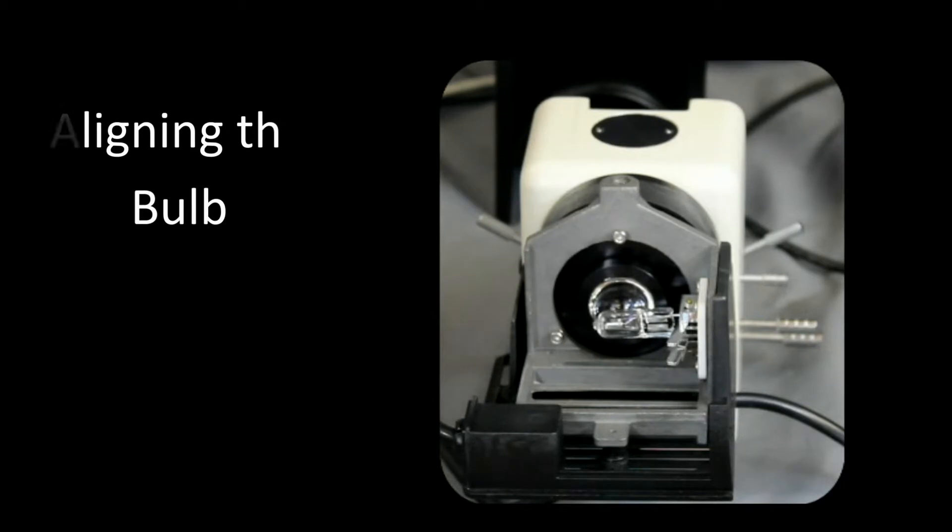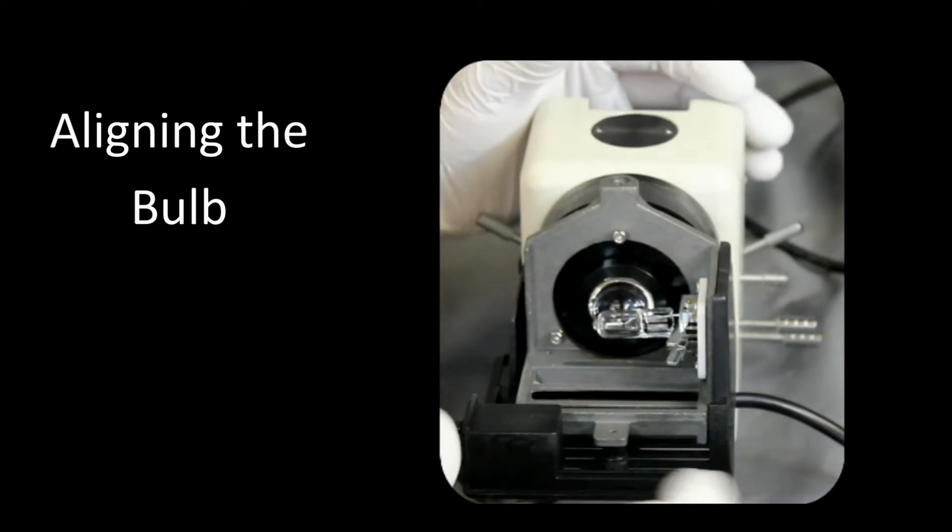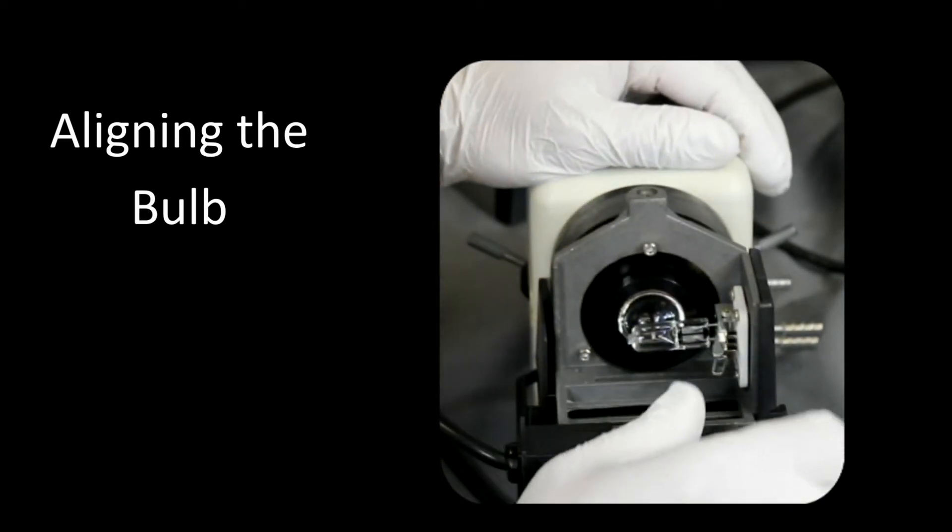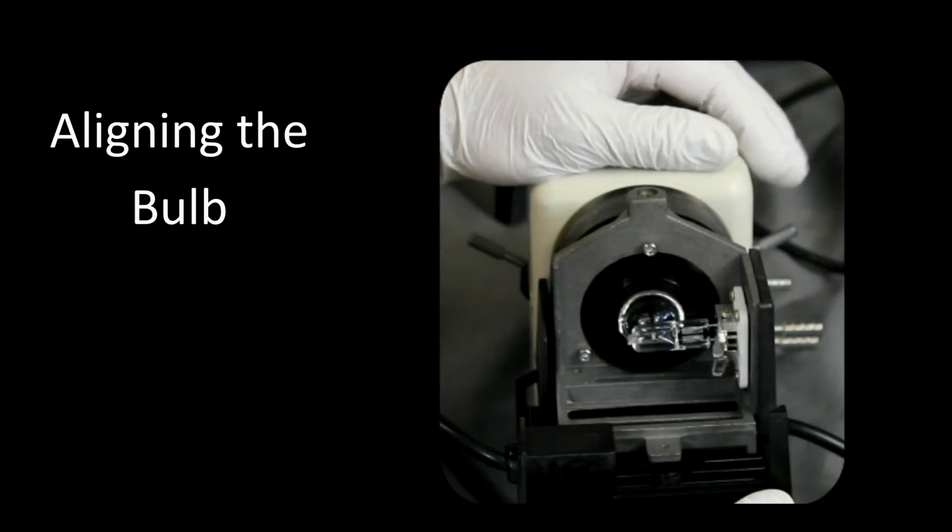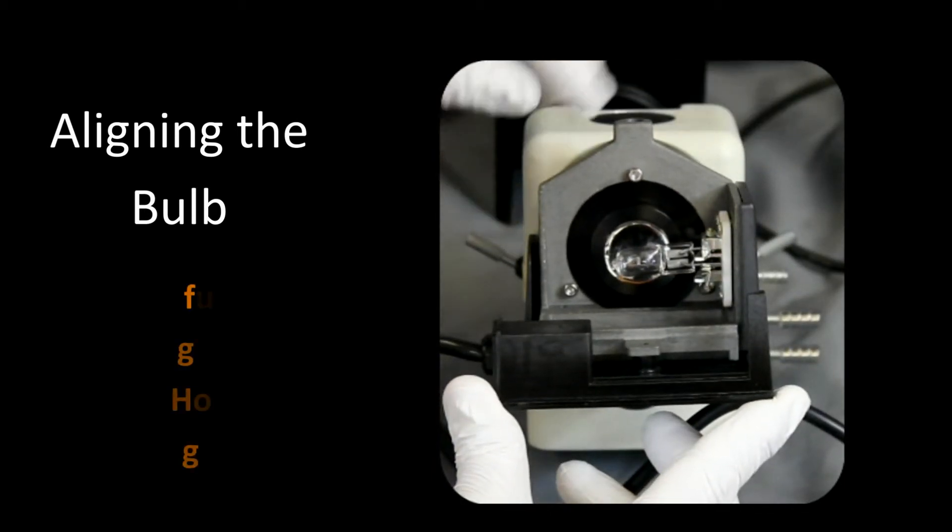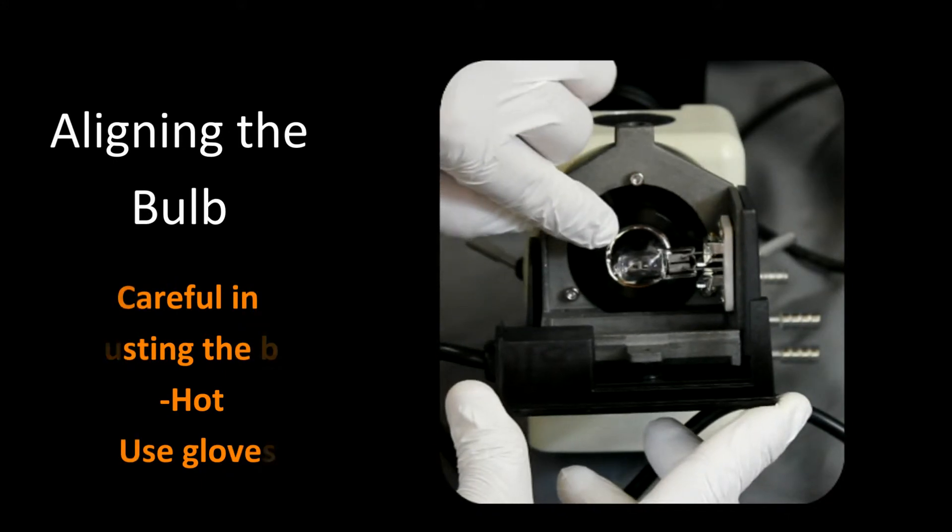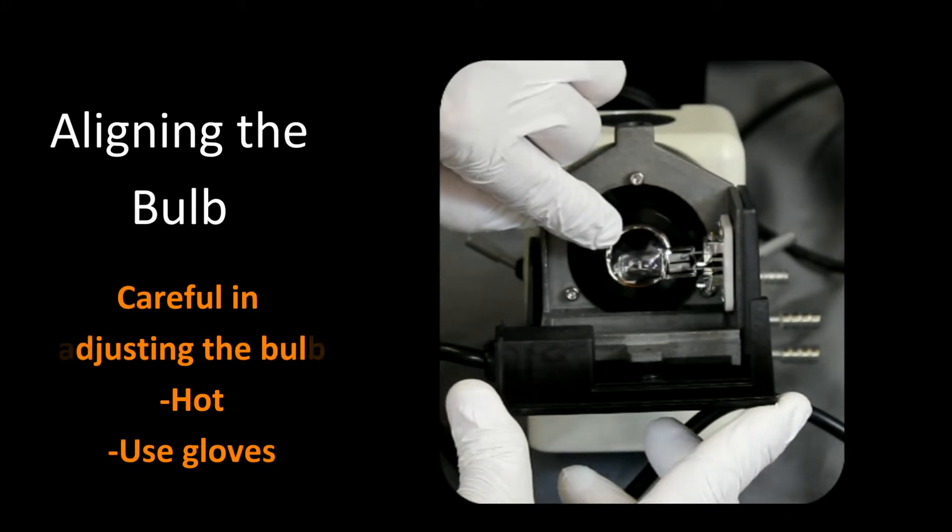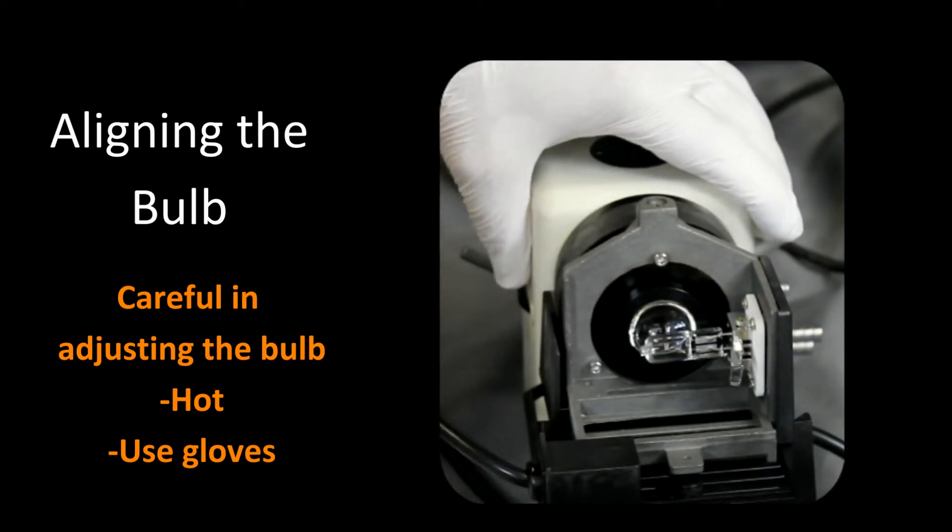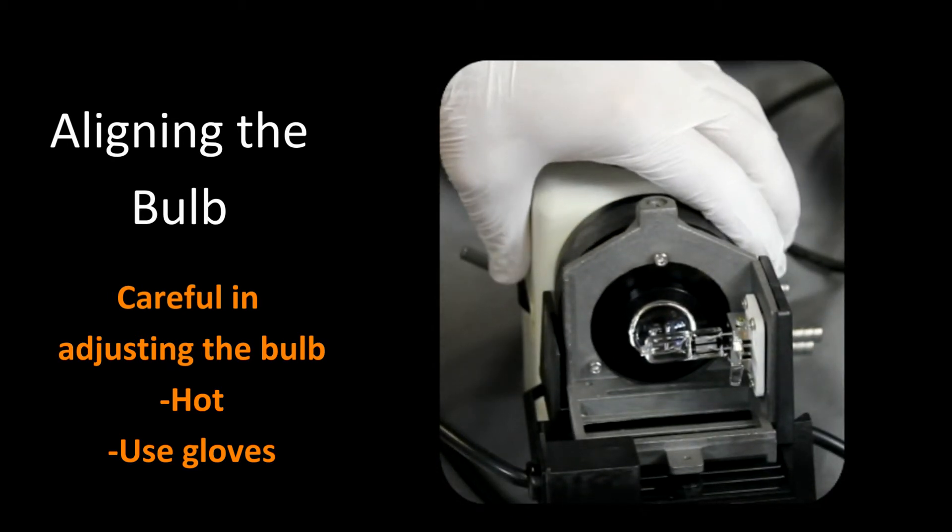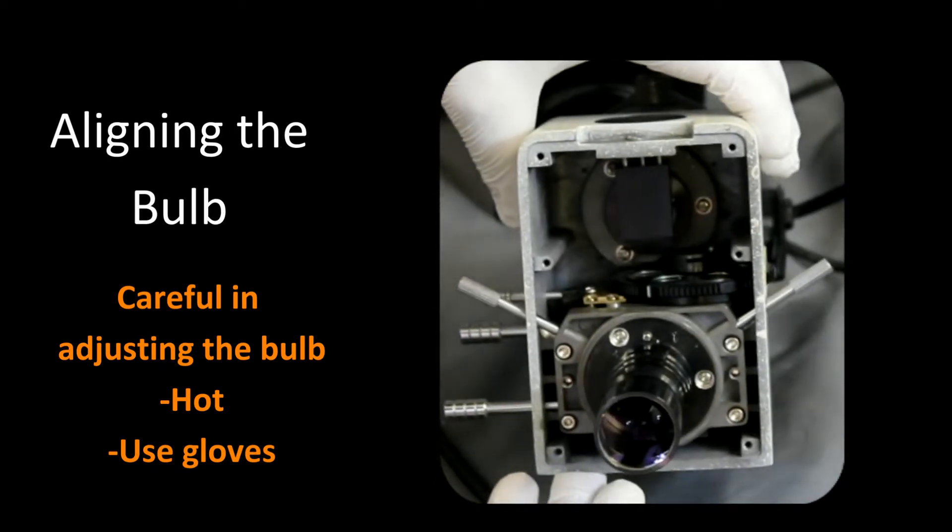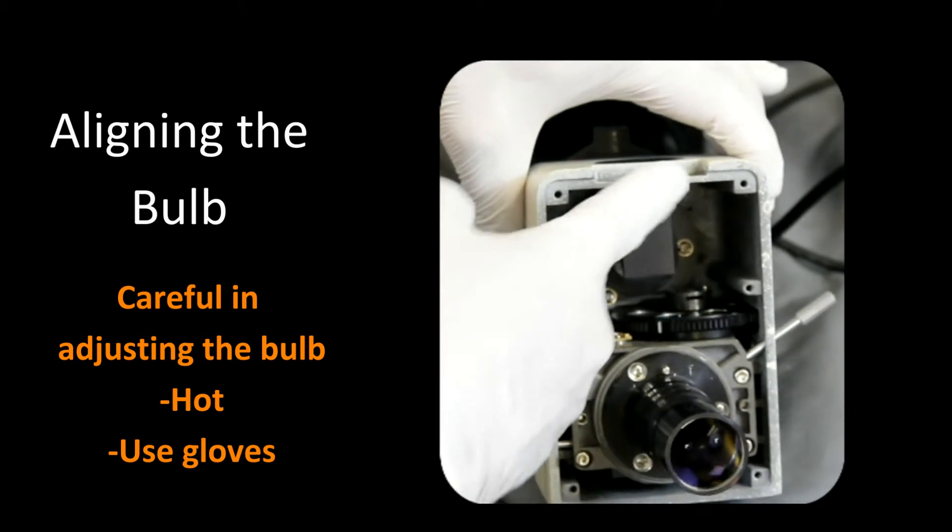To optimize the light through the optical system, first thing we want to do is we want to make sure that the light bulb is aligned. Now the light bulb by pressing these two levers here will allow it to pull out. So we want to do as a rough measurement is we want to have this aligned to about the center of this lens here. Now in many cases that might be sufficient enough, but if you really want to optimize the light, what you're going to need to do is you're going to need to take off the lamp housing and remove this cover plate here.